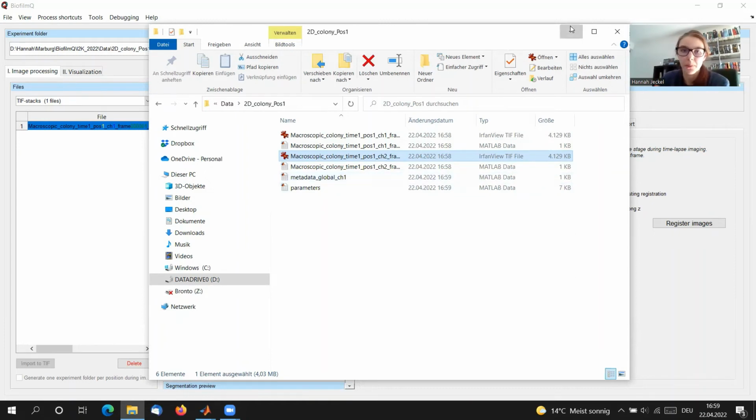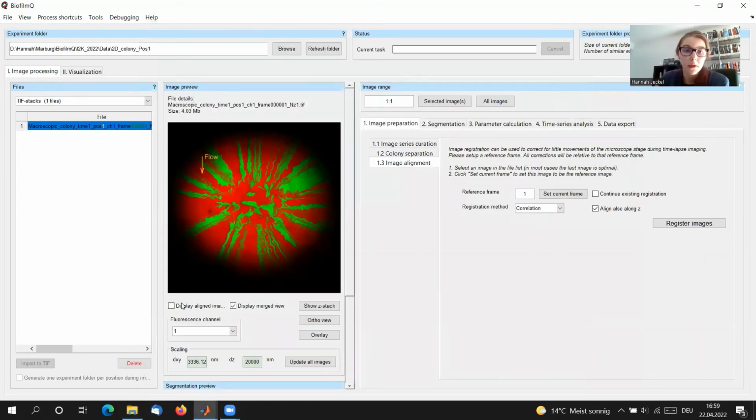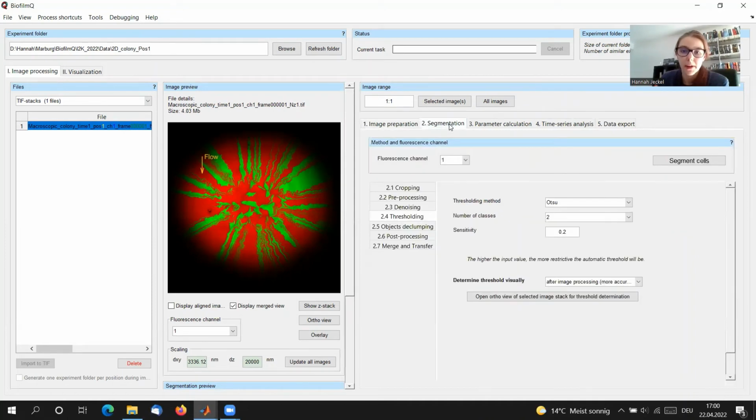All right, so now coming to this particular image, what is it that I would want to know from this image? What kind of information can I get from there? Well, this is a prime example for how we can use the merging strategy or the merging tool of BiofilmQ to make sense of our data, to combine 2 channels and read the combined information. So this is what we are going to try today.